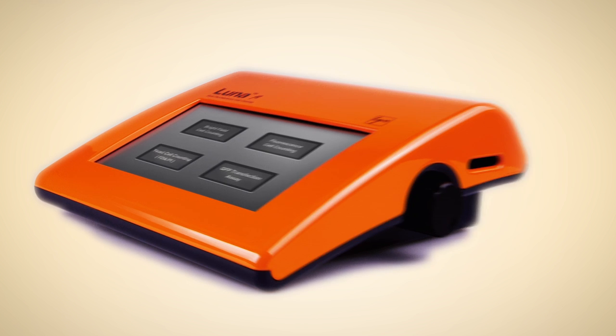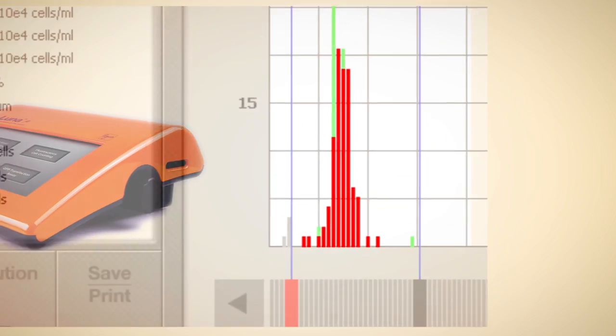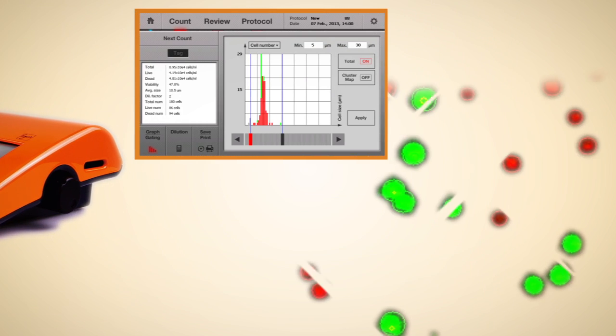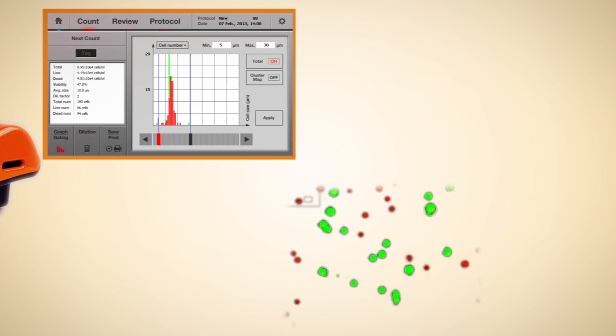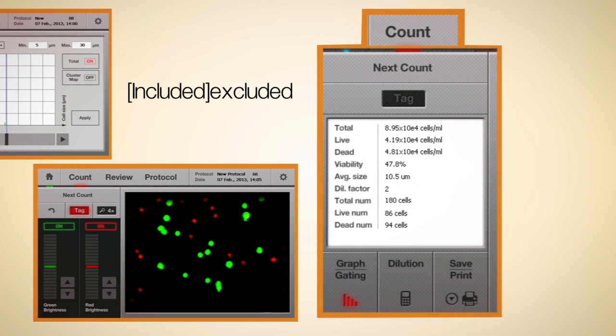Integrated analysis software gives immediate viability data. Counted cells can be gated based on cell size information. Particles can be easily excluded or included by simply defining the cell size in the count data.